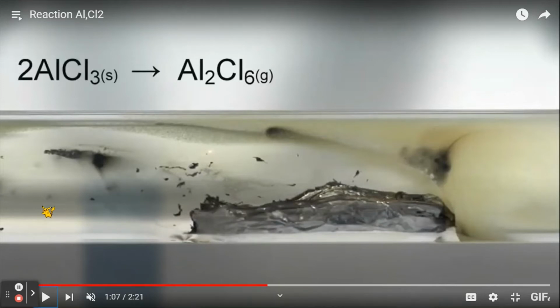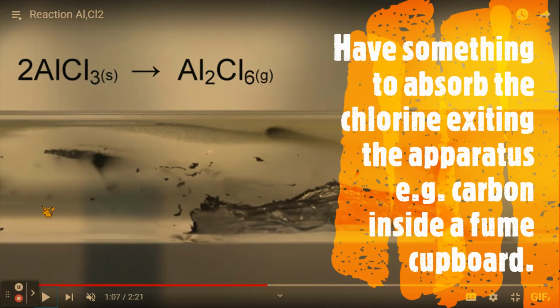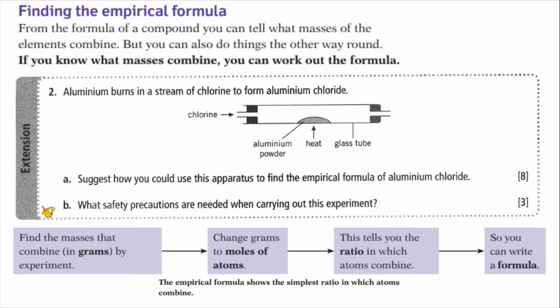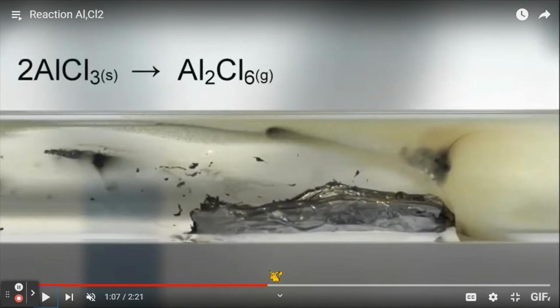Carbon was actually used in World War II in gas masks. The carbon was placed in there because chlorine was actually used as a weapon in that war. So a nice little link to history there. And let's just see what happens.